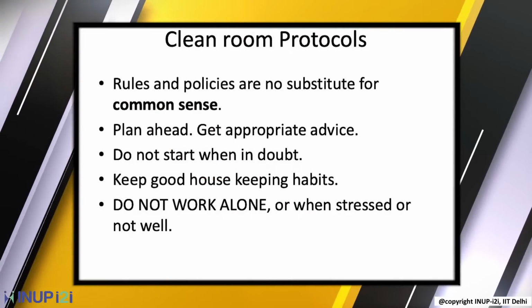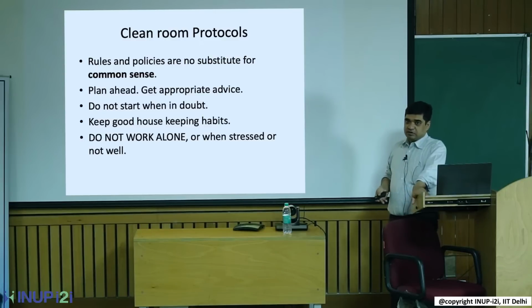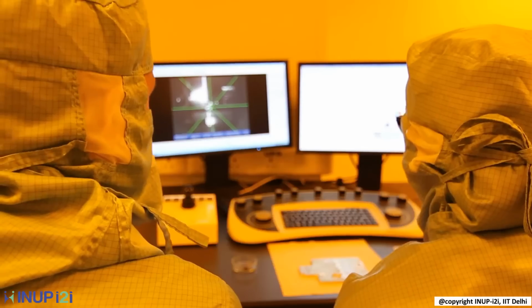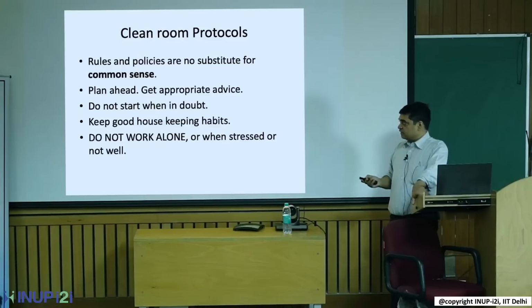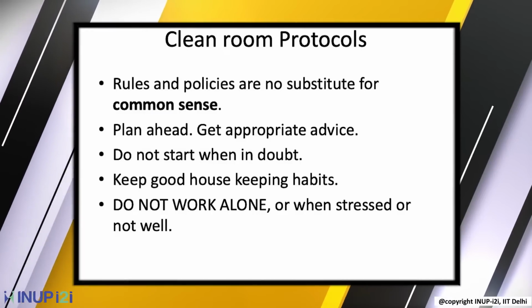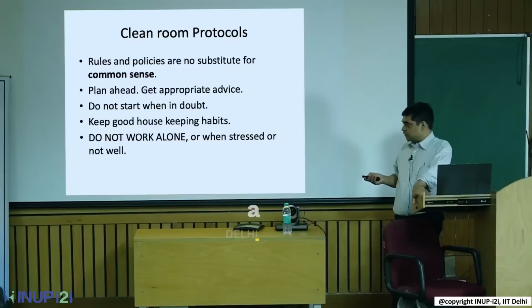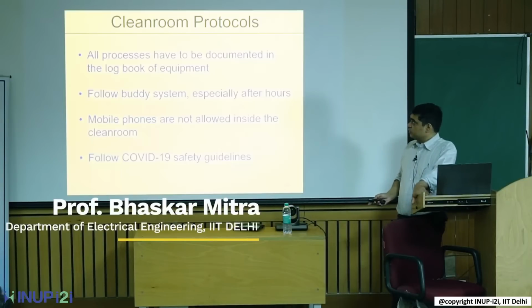That's not just our clean room, any clean room. Plan every process in excruciating detail. Talk to people if you're not familiar. Understand what parameters, everything that you're doing, then you go inside and do it. Don't start where in doubt. I found good housekeeping is very, very essential, right? It maintains cleanliness, and it also puts you in a mindset where you're more organized. Do not work alone, stressed or not well. Again, going with this, work with patience and slowly.